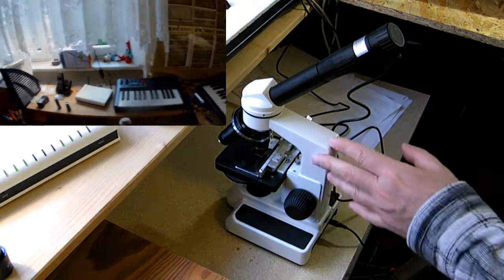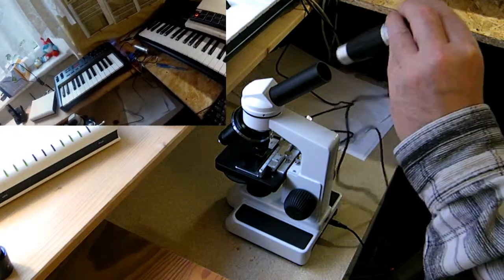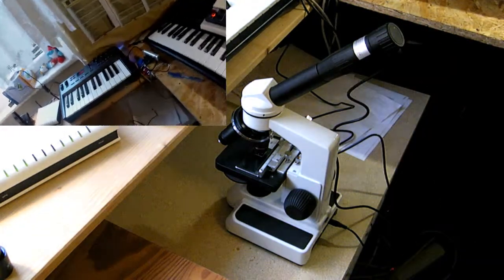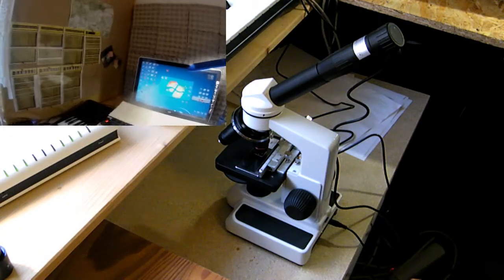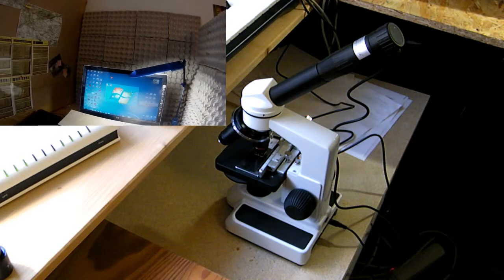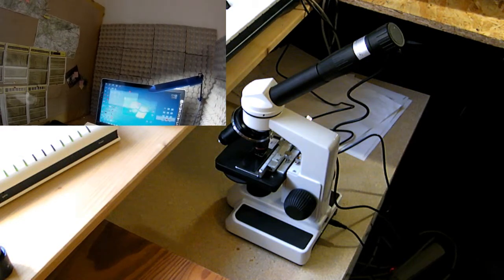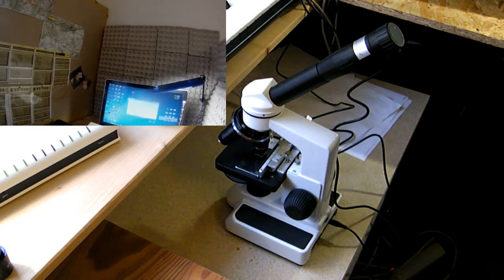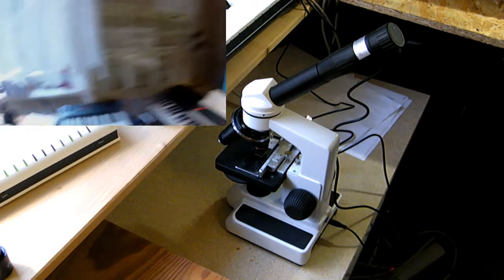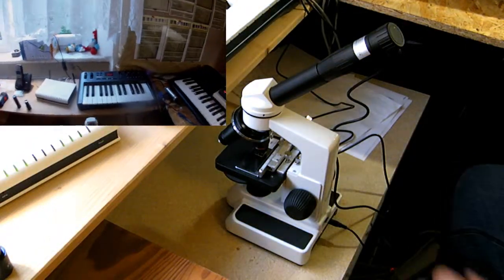In the meantime, I have moved the microscope from a huge table nearer to the computer, and here is the USB lens. I've inserted it, and I've installed the driver for this USB lens, not yet the photo optimizer software. And let's have a look through the microscope. All right, let's start it. What I have to do is to choose the device. It's called USB 2 PC camera. This lens, and it's still a housefly's legs under it.